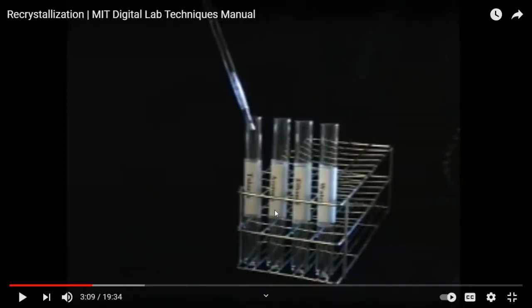To perform a solubility test, place approximately 20 milligrams of your compound in a test tube. Add a half of a milliliter of solvent. Did you memorize how many milligrams? You'll have to memorize the milliliter as well. Then you know the percentage for a solubility test.